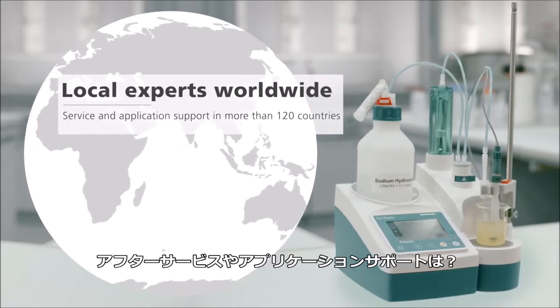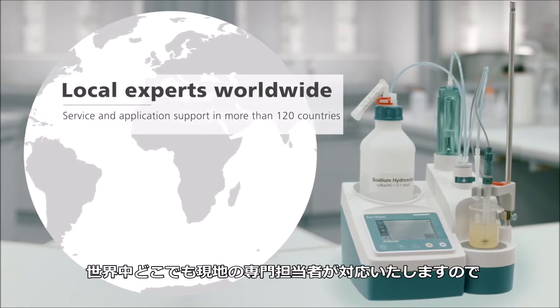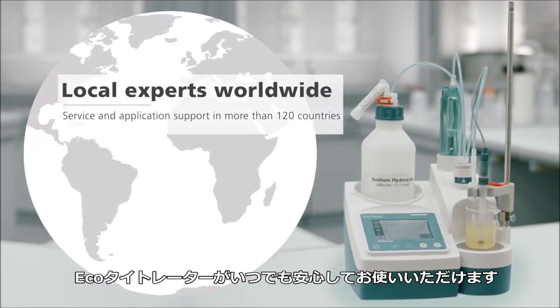Service or application support needed? Wherever you are, you can rely on our local experts to make sure your EcoTitrator is always available.